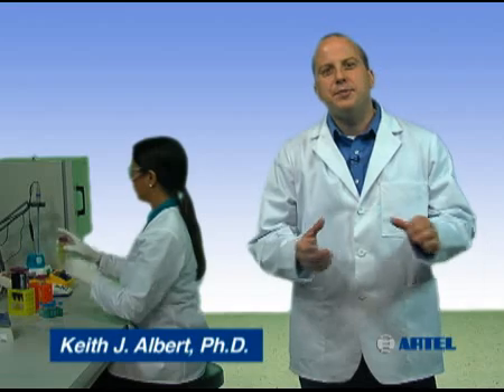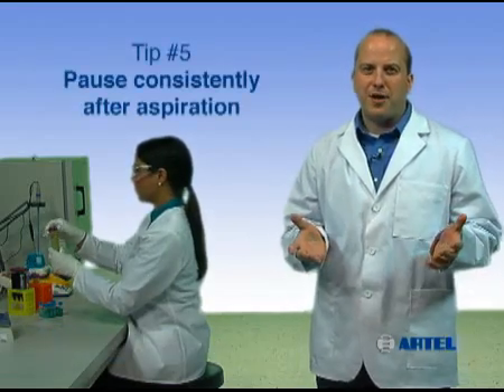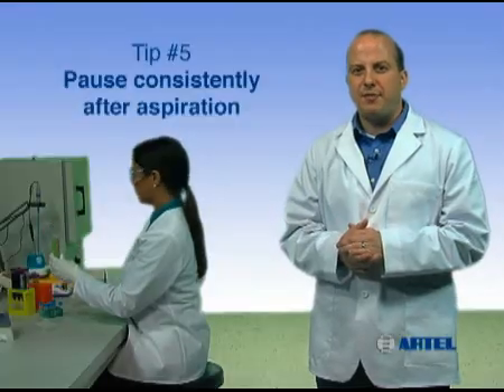Knowing how to properly use a pipet will help you obtain better liquid handling quality in your lab. Pipetting tip number five: pause consistently after aspiration.